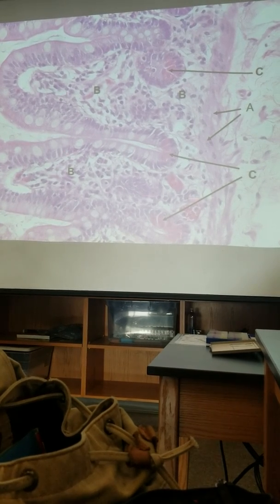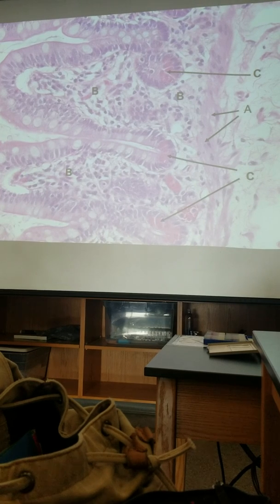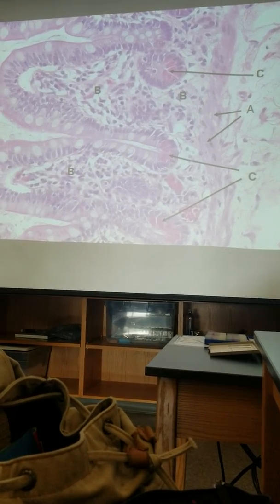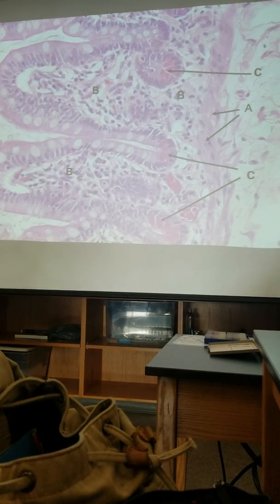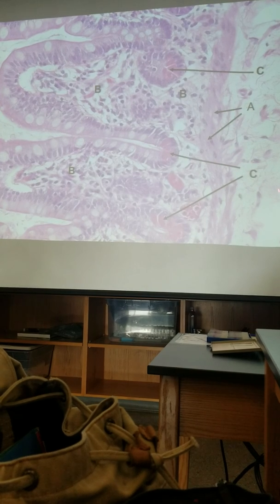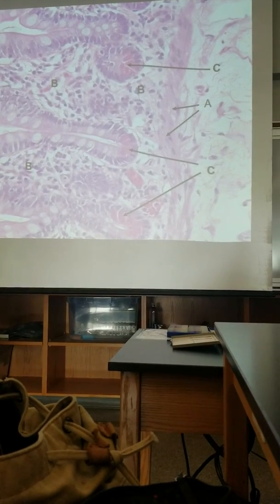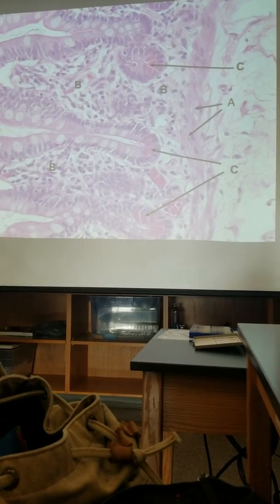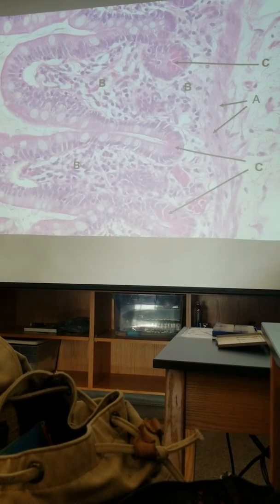And then what organ are we looking at? All I was looking for was small intestine here. Because you can't know for certain what part of the small intestine you're in. The fact that we don't see any glands here leads us to believe that it's probably not duodenum, but then again, we didn't really get to see enough of the submucosal region.